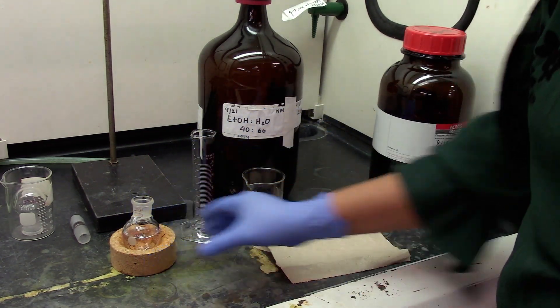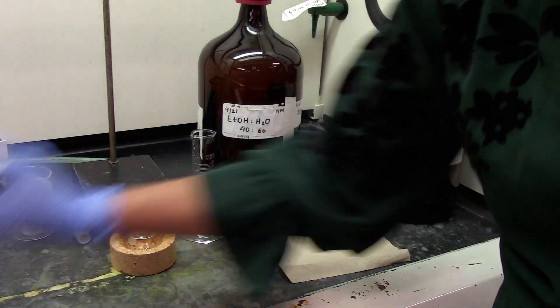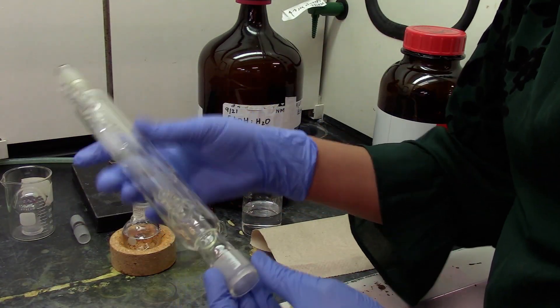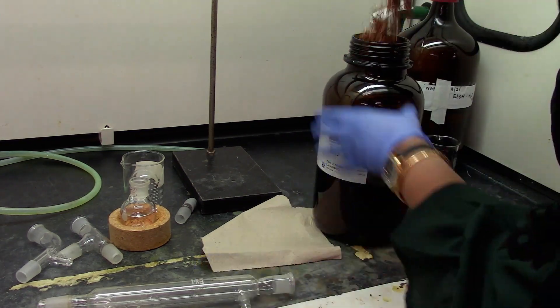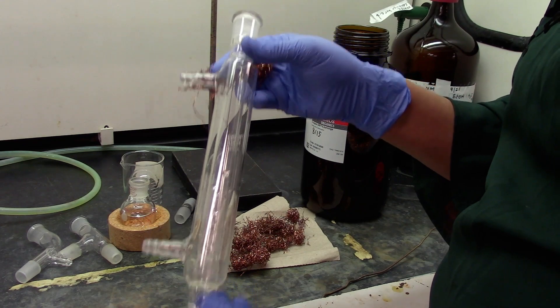Now our starting solution is ready. We will get started with packing the distillation column with some copper turnings.